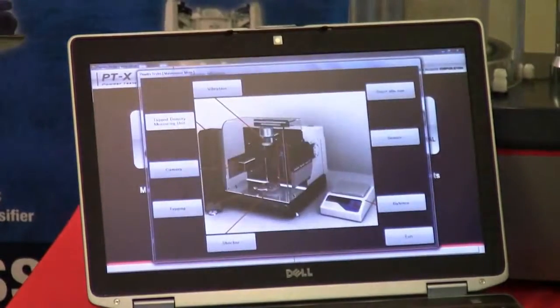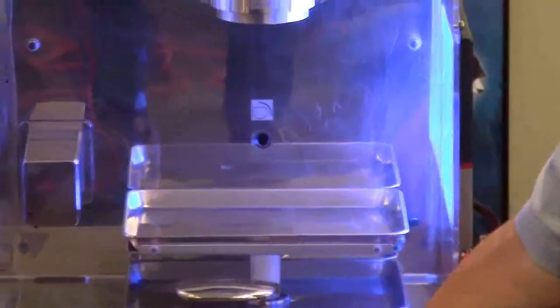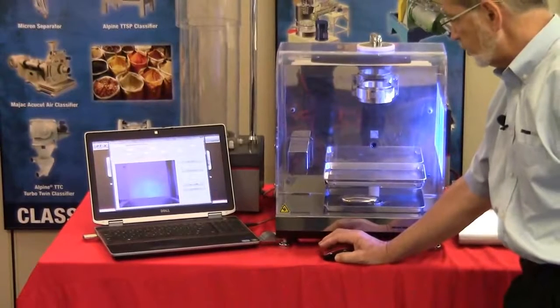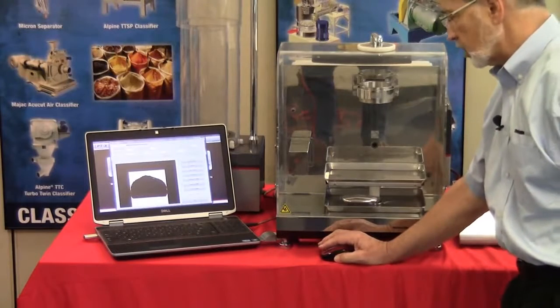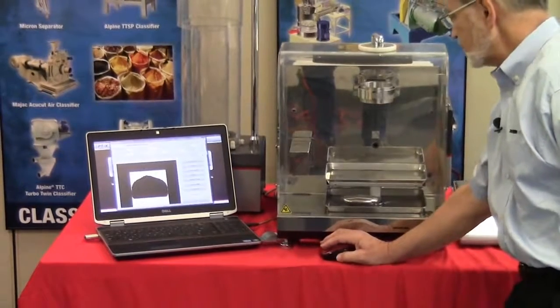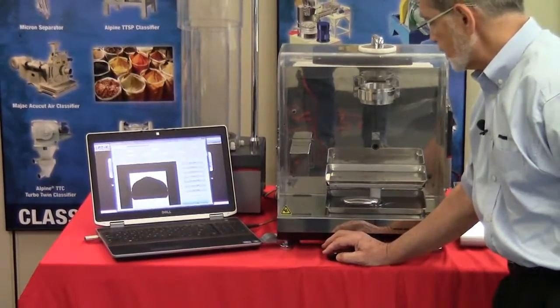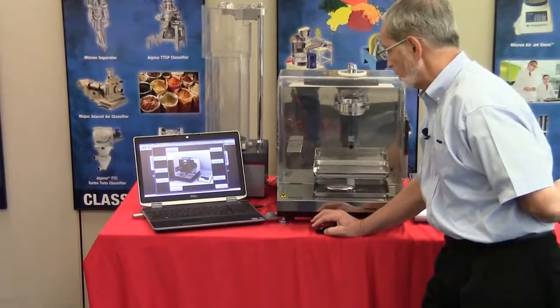Maintenance mode, provided your equipment is communicating properly. Let's take, for example, the camera. We can go into the camera, we can turn the backlight on, as you can see the blue light. We can capture a picture once everything has been determined to be in a proper focal field. We can then take the picture and binarize. Of course, there's nothing there, so we're not going to get a true angle here. Then we calculate the angle to determine what's taken place. In this case we're not going to get that because we don't have any of the instruments to set that up, but that'll be all squared away in the actual setup video.